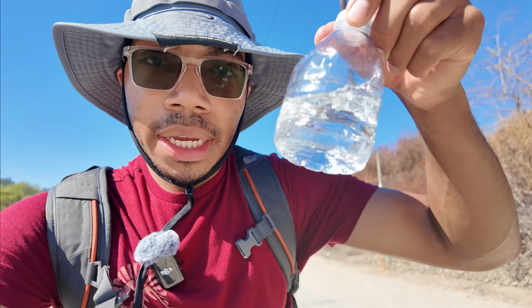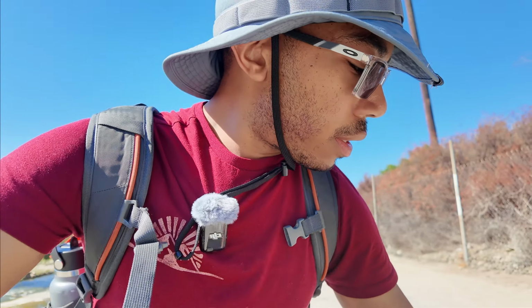I've got purified water here, and if we put this water in the bag, we'll see what the TDS value is for bottled purified water. Sometimes if they say spring water, the TDS values can be quite variable. But based on the claim that they make on the bottle, you should have a pretty good sense of what that value should be. The value might be a little bit elevated since I am using the same bag I just used to sample river water, because I didn't want to waste too many bags. So I'm going to do the same thing. I'm going to submerge the probe in this purified water and wait to see what that value is.